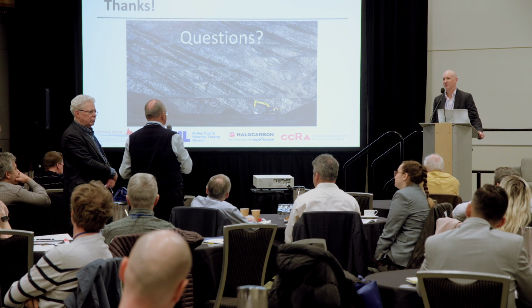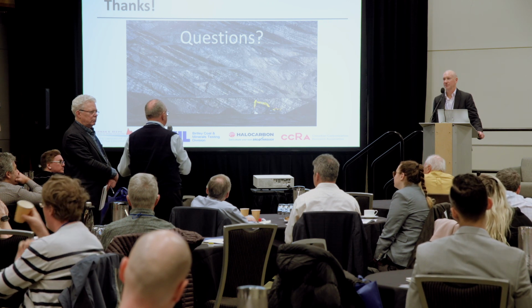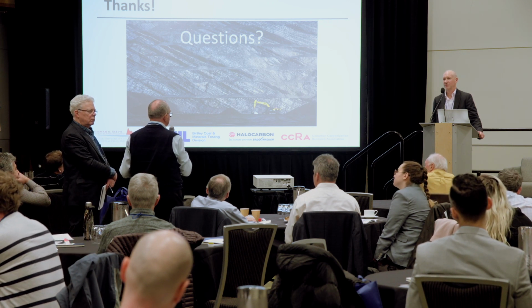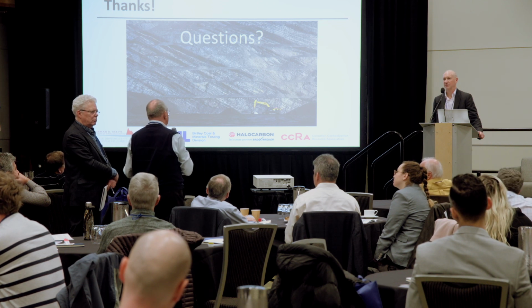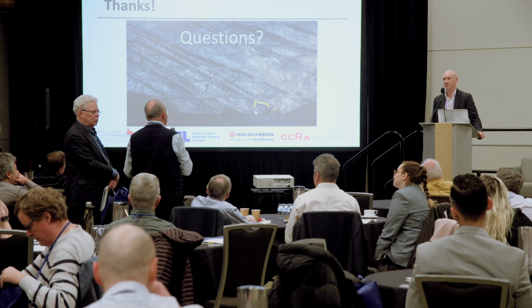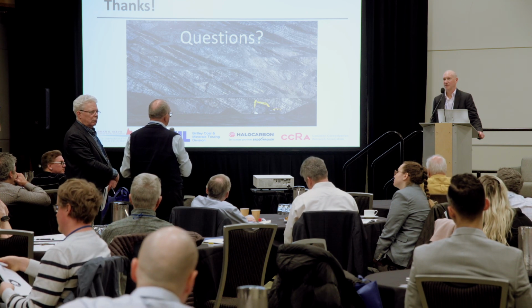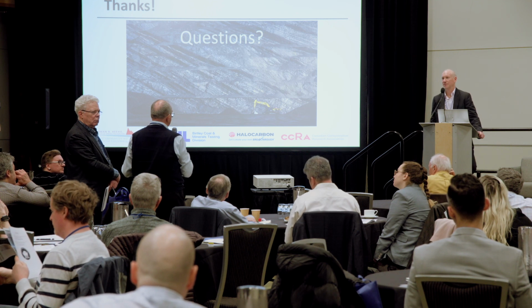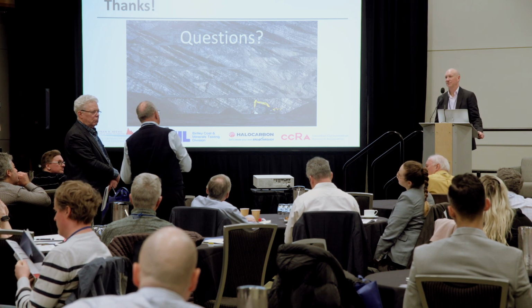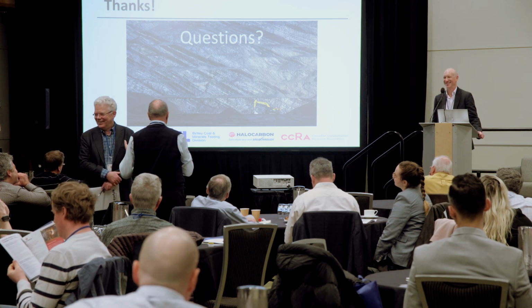I'm fascinated by this because you and I have had this connection with the jig, first of all, which we're interested in Australia. We are scared in Australia of having to continue trying to protect ourselves from using organic liquids to do float-sink tests. And we don't want to use heavy media mixtures. So the ROM jig provided an alternative. What you've now done provides, I think, a long-term option that will eventually create a lot of interest worldwide. And we have a lot of projects that we'd like to get going in Australia. I'm kind of halfway between being a Canadian and being an Australian right now. I can see a lot of the things that are being described. I've been to 10 conferences in the past year and heard the same thing in Australia.